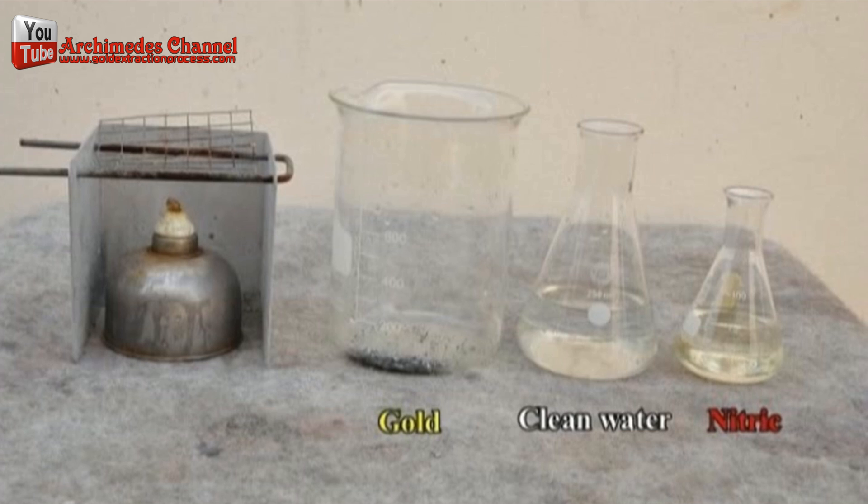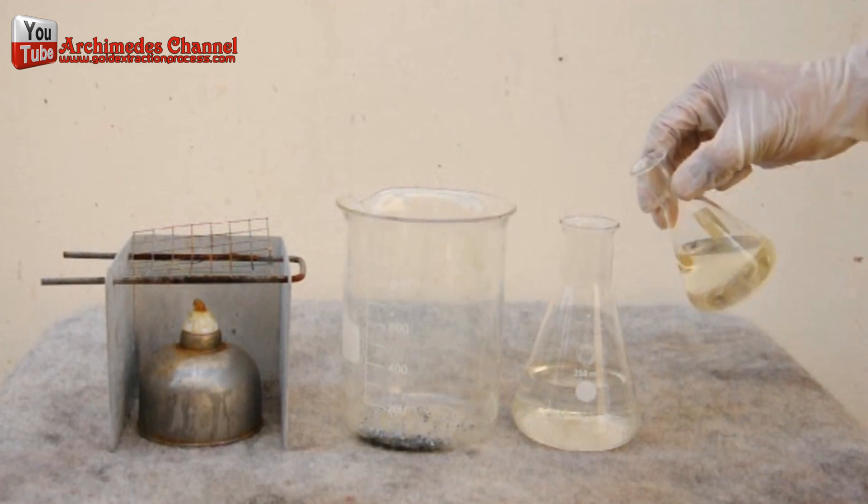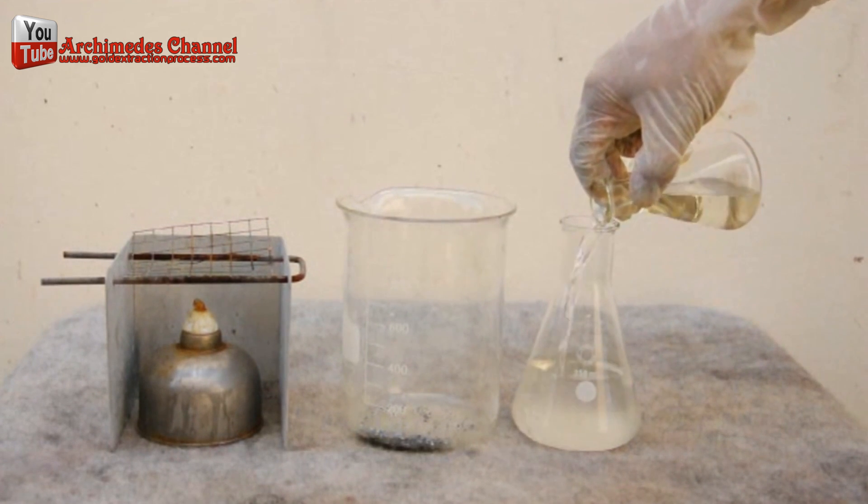Nitric acid mixed with water at a ratio of 1 to 1. Boil the nitric acid at 80 degrees Celsius and boil until there are no air bubbles.